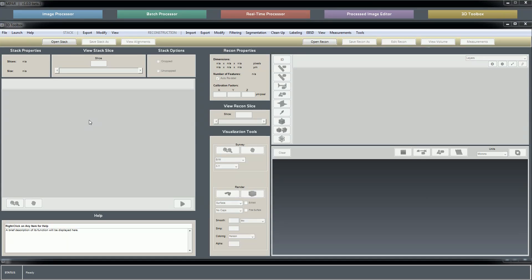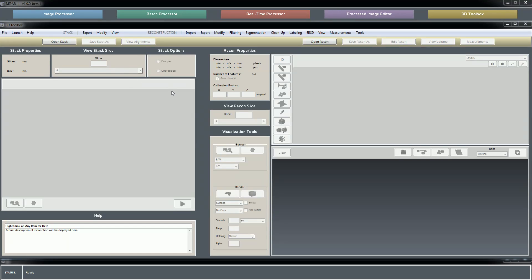But in the future, MIPAR will support reconstructing a volume from the tilt series. In that case, the image stack would be much different from the reconstruction in that the image stack would be your tilt series and the reconstruction would be, say, the product of your back projection, your actual reconstructed volume from that tilt series. So that would allow you to work on the tilt series both pre and post-reconstruction.